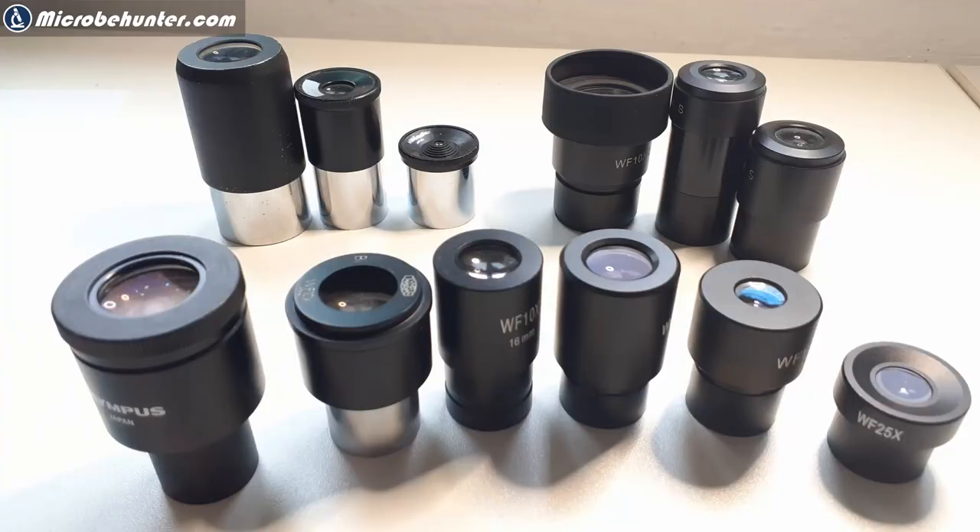Now to the other question about disassembling eyepieces and putting them back together. In order to explain this, I'd like to give you a bit more background information and a more comprehensive treatment of eyepieces. Let's have a look at the different types.